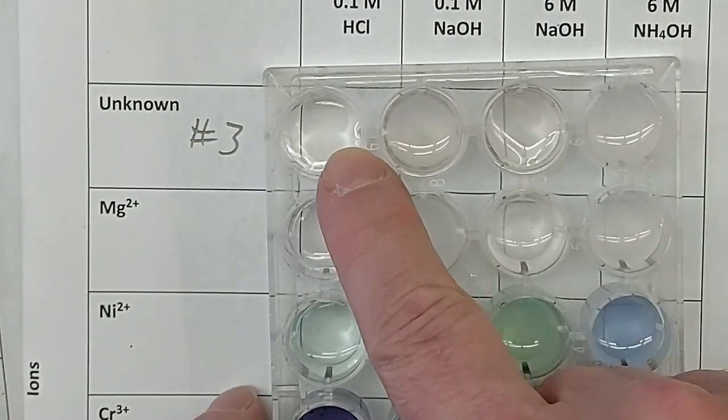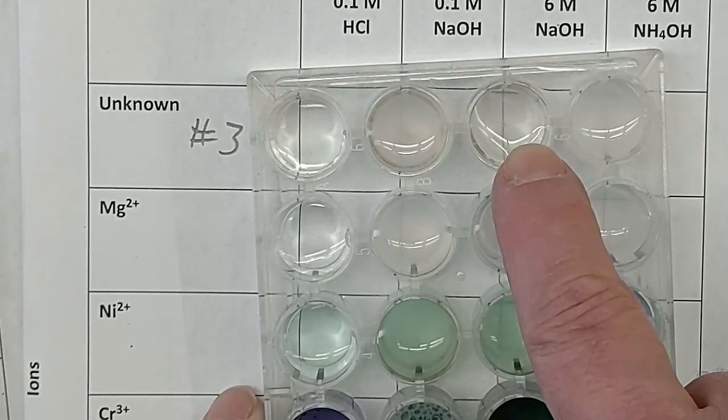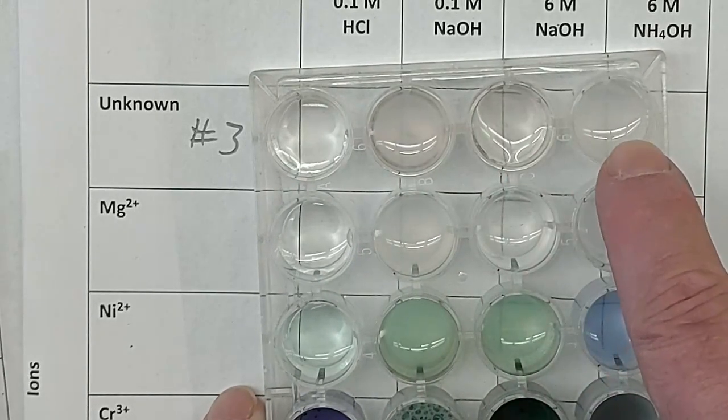What is it when it's with HCl? What is it when it's with the 0.1 molar NaOH? 6 molar NaOH? 6 molar NH4OH, ammonium hydroxide.